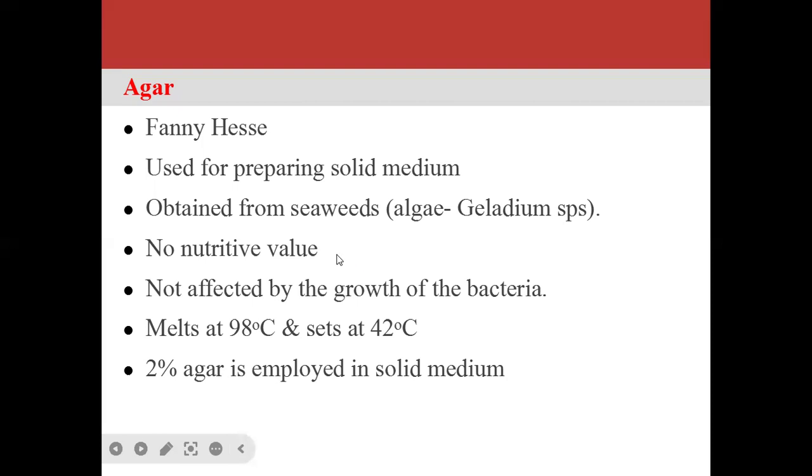It doesn't provide any nutrition to the bacteria, and it just acts as a solidifying agent only. In the preparation of solid media, generally we use 2% of agar. And see, New Zealand agar has twice the jellifying capacity of Japanese agar.